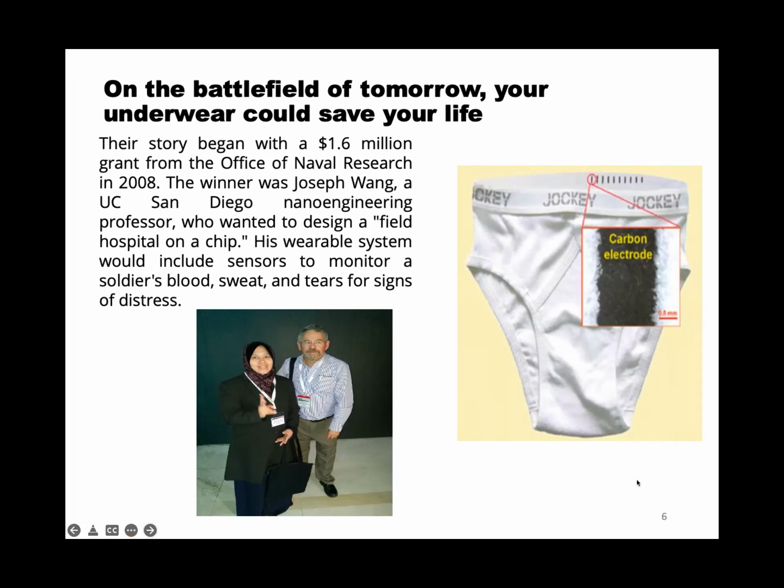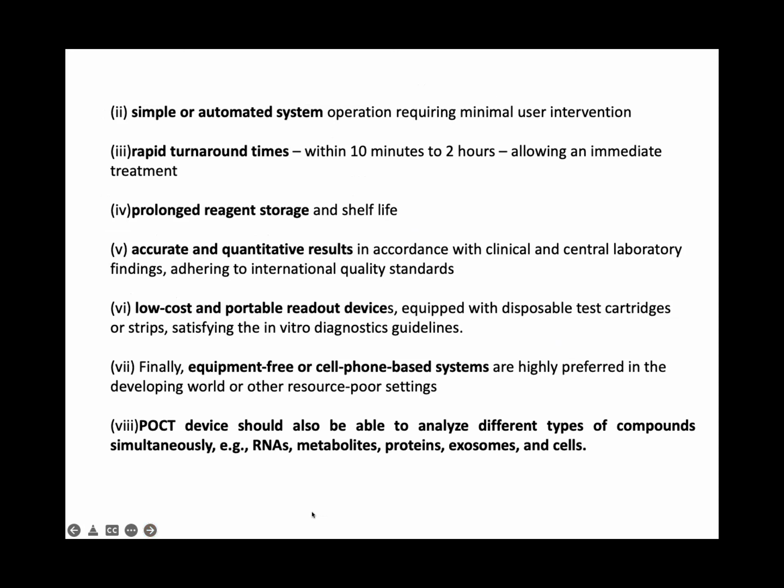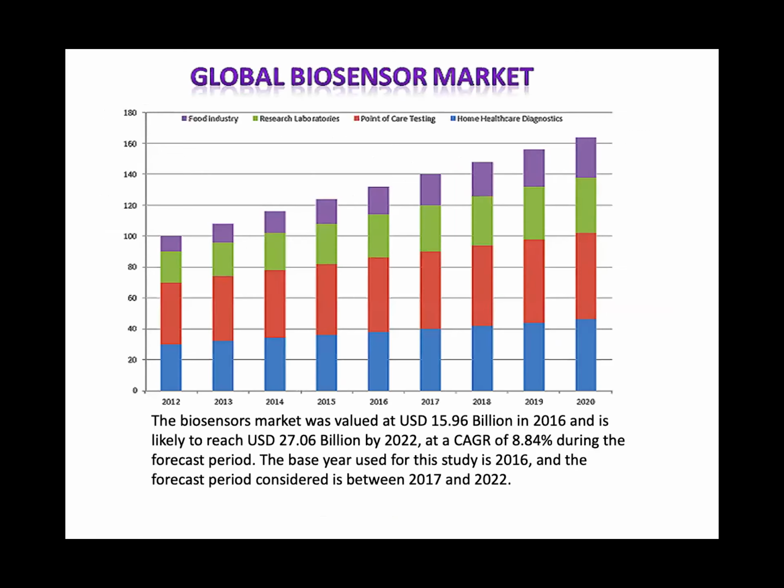So you can see that electrochemistry is very robust. And of course, I'm using it for biosensor, chemical sensor. But apart from that, there are a lot of other applications in other types of samples. For example, if some of you are working in paints, electrochemistry is also being used to study corrosion. Yeah. So there are of course other applications as well, right? So I think that's it.